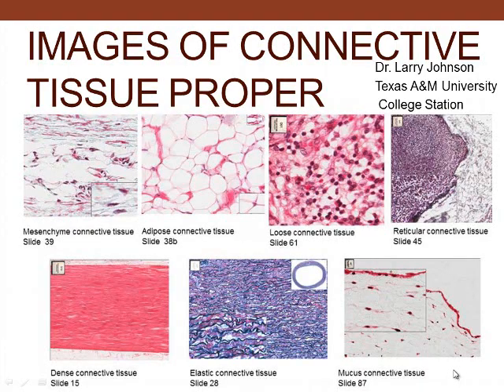Images of connective tissue. I'm Larry Johnson, a professor at Texas A&M University at College Station. Here we can see mesenchymal cells — connective tissue that serves as a source of precursor cells. You see these fibroblast-like precursor cells, fat cells with a visible nucleus, and other connective tissue cells such as neutrophils.